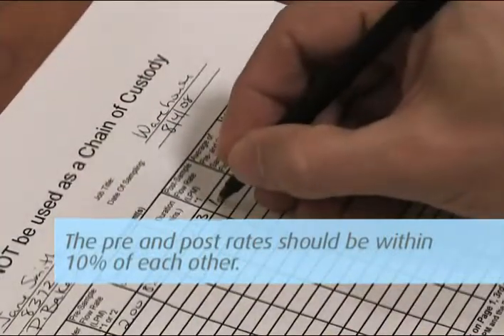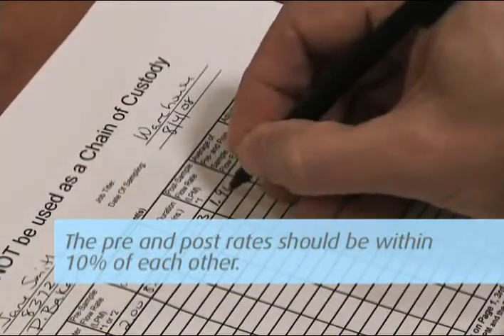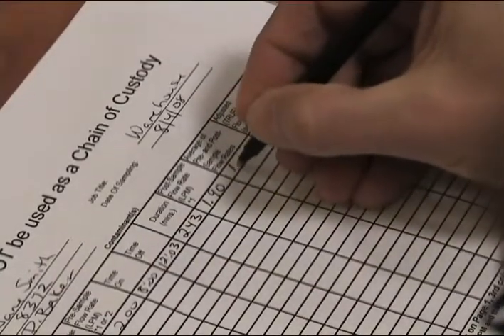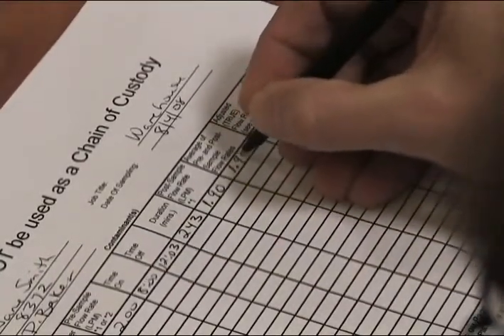The pre- and post-flow rates should be within 10% of each other. If they are, average the flow rates to determine the flow rate to be used to calculate the air volume.